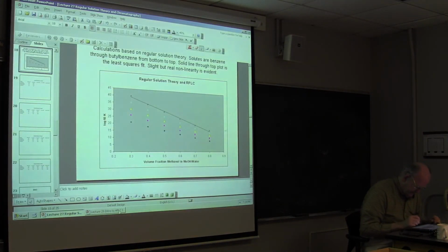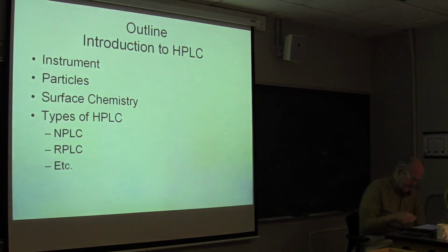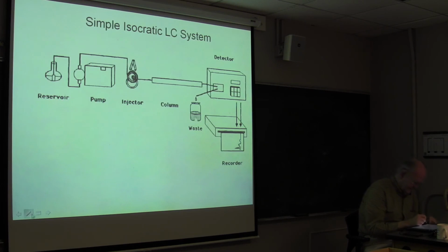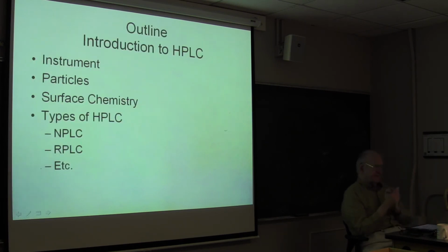So, we're starting into a discussion of HPLC now. It's going to take us a number of weeks to go through HPLC because there's instrumentation issues, there's chemistry issues, and then there's a whole bunch of different kinds of HPLC. Basically, GC, there's gas-liquid chromatography and gas-solid chromatography, and that's it.